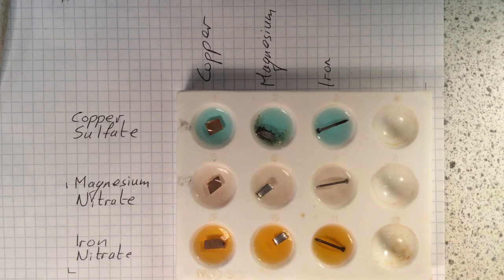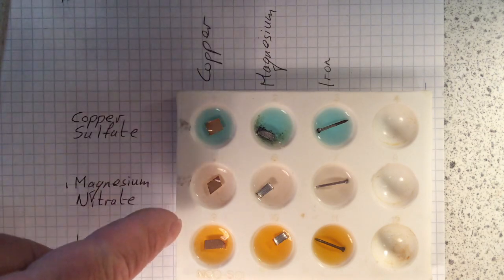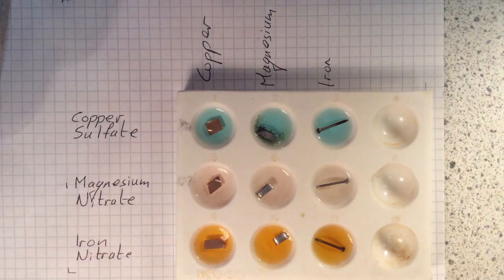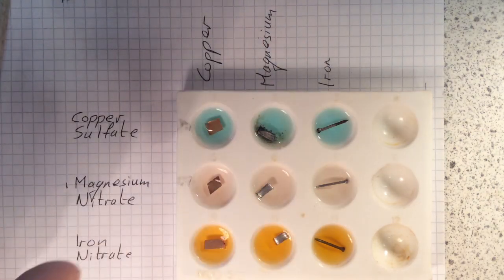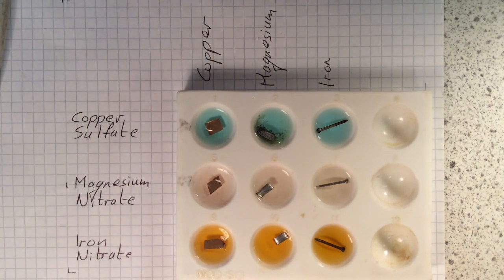Now you look at the magnesium nitrate. It's not reacting with the copper. So the copper's come along, tried to steal the nitrate, but it's not getting anywhere with that because the magnesium is more reactive, so it cannot displace the nitrate away. Magnesium and magnesium, well, there's nothing going on there because it's fighting itself. And then magnesium and iron. Now that iron nail has stayed shiny, which means the iron has tried to steal the nitrate away from the magnesium, but it can't because the magnesium is more reactive than the iron, so it won't win in a fight.